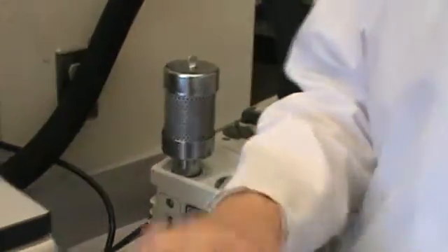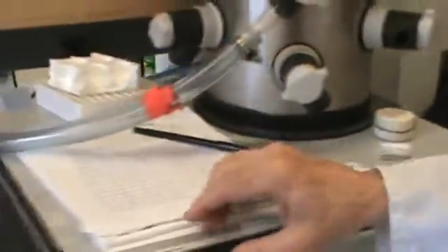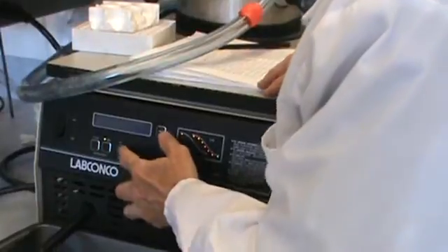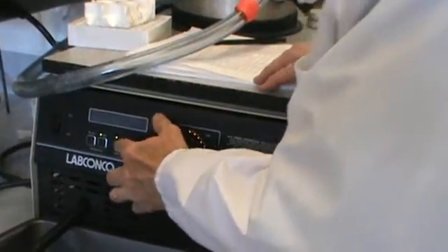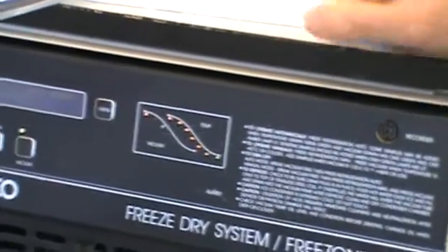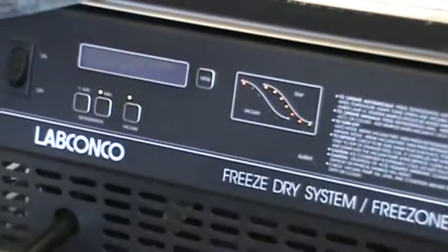So go back to here. The temperature is lighting up so we can start the vacuum. Meanwhile, discuss the options you have which of course we've done these first.